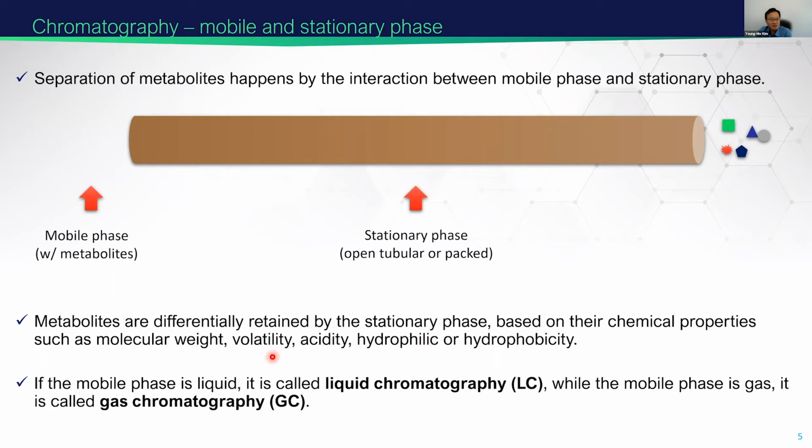So if the mobile phase is liquid, we call that liquid chromatography. And if the running mobile phase is gas, then we call that gas chromatography.